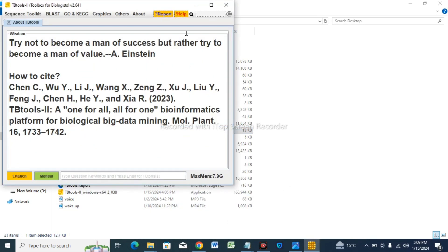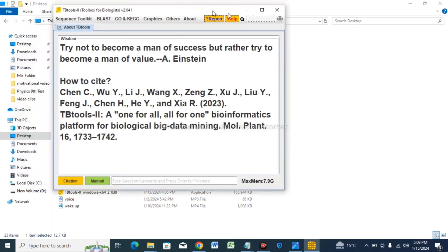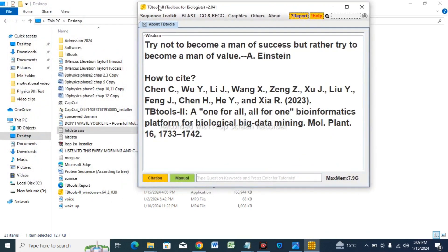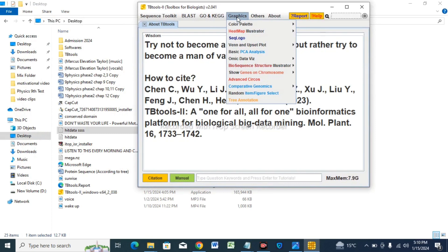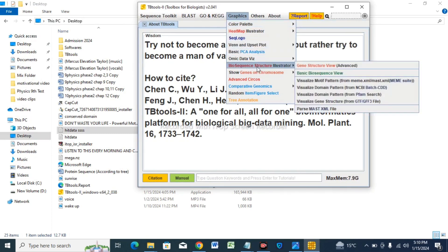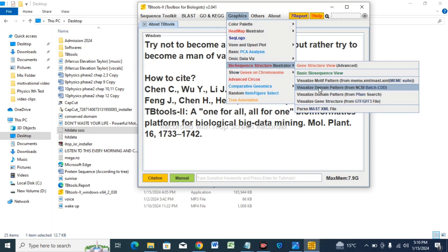Now tap on the Graphics option and scroll down. Tap on the option BioSequence Structure Illustrator, and then Visualize Domain Pattern from NCBI Batch CDD. Tap on it.